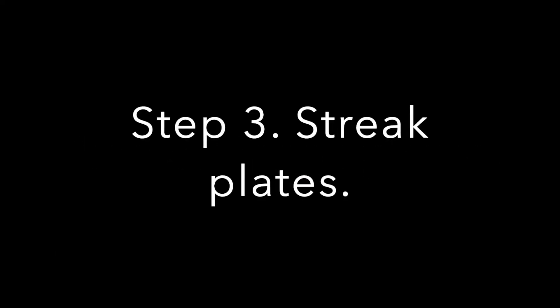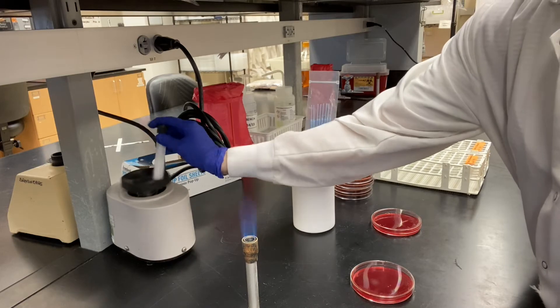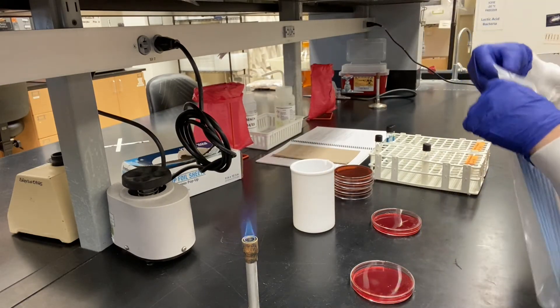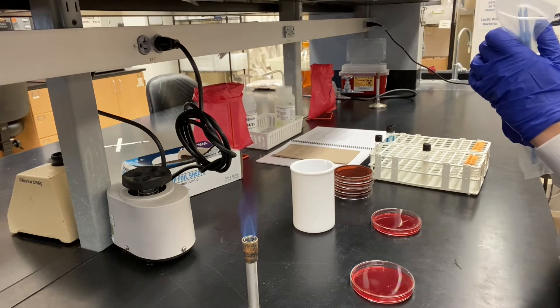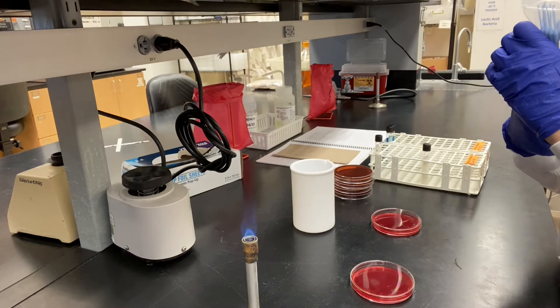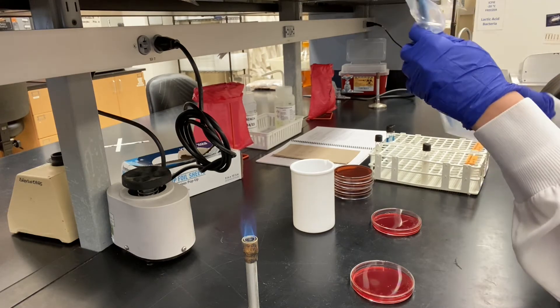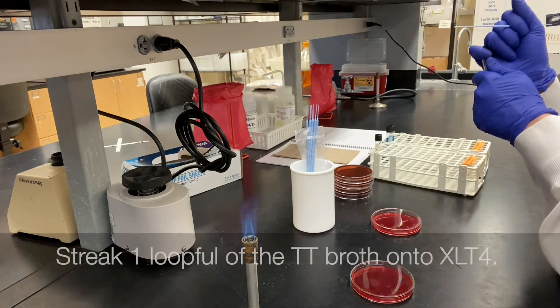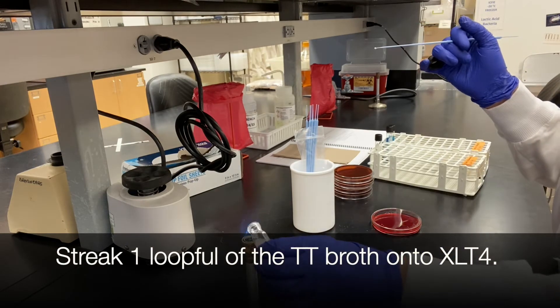Step three is to streak your plates. Streak one loopful of the tetrathionate broth onto XLT4 agar.